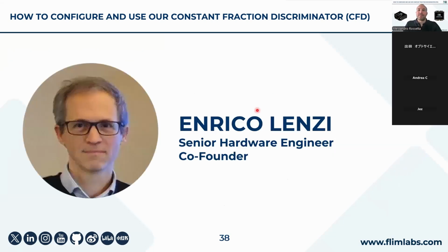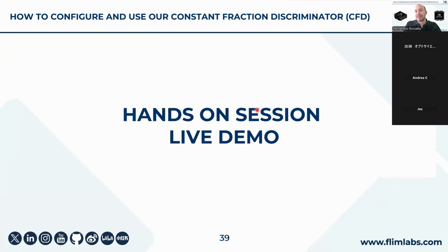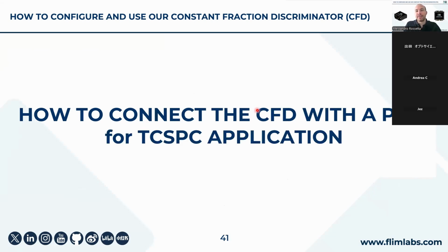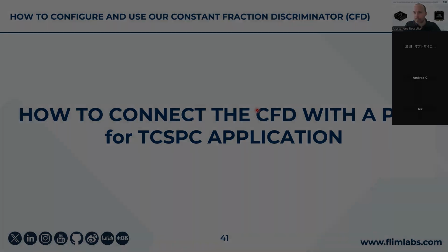But now, let's say we have a hands-on session together with our senior hardware engineer, Enrico Lenzi, who is with me today in our lab, and you'll see in a bit. We're gonna have a hands-on session with a live demo, and we'll go over how to adjust the input threshold of the CFD, and how to connect the CFD with a photomultiplier tube for a TCSPC application. We'll show you also how to adjust the pulse duration of the output.